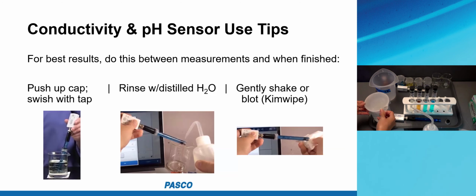So here's what I mean by that. Everybody's used to doing this part where I have this beaker of water here. This is just tap water in this beaker. I just didn't want it to evaporate. That's why it was closed. So I'm going to rinse the probe with distilled water from a squirt bottle. Swish. Rinse again.